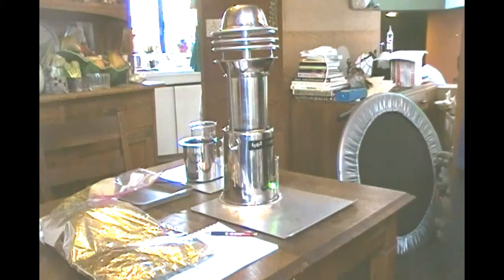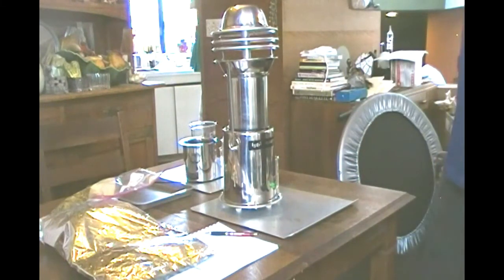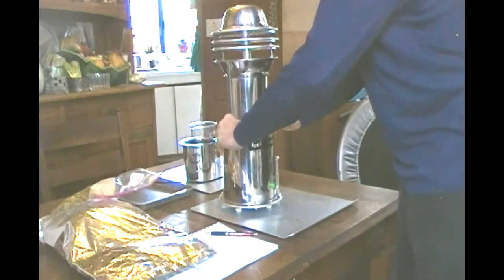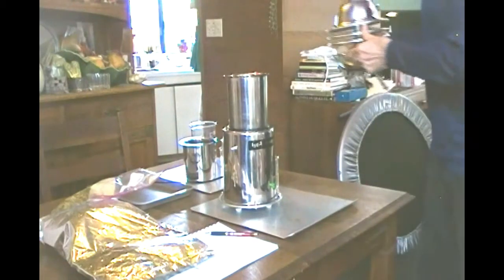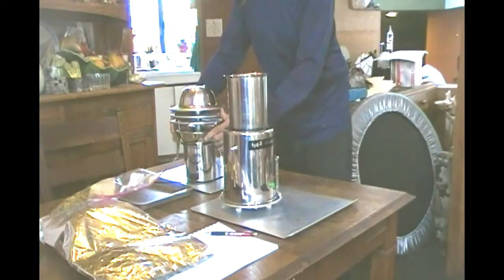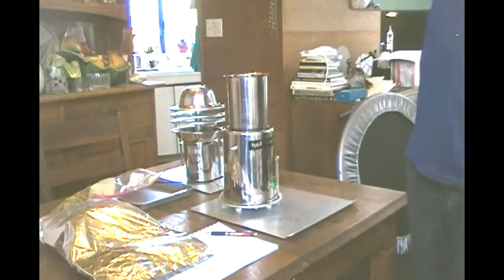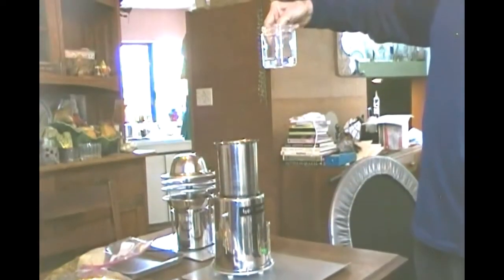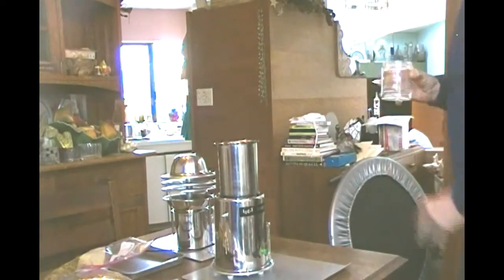It's been about 6 hours. We're going to open it up and see how our alcohol collecting is going. So first we turn off the switch. It's good to let it sit for a minute or so to cool off. Carefully, equal pressure, off with the condensing unit. And I see that we have reclaimed this much alcohol in the reclamation jar. So I'm going to go put this back in with our clean, fresh, new alcohol.